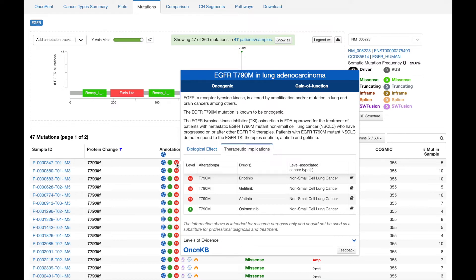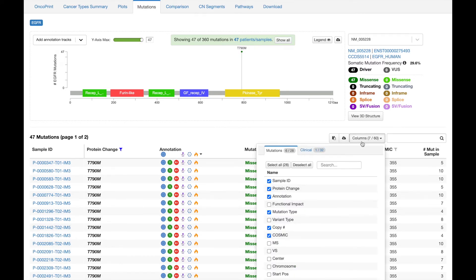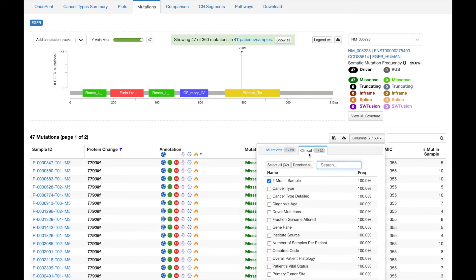Let's see if there's a clinical attribute that can tell us. Here in the columns dropdown, there are options to add additional data to this table. Recently, we added all the clinical data, so all the same data you see in StudyView, all of that can be added here.